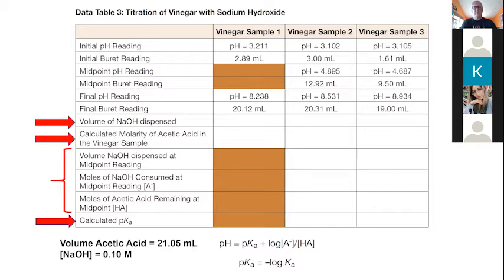Yeah, we're doing them in triplicate. Okay. So we do it like one after the other? Yeah. These don't take very long to do. So I mean, you'll see it takes maybe 5 minutes per run. So it won't take very long to do.